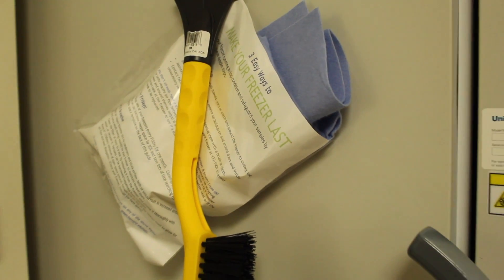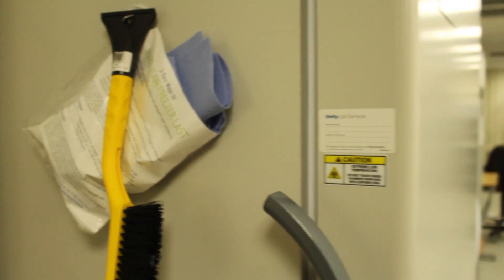In addition, we also manage our freezer library through an Excel spreadsheet, so we know exactly where each of our plates is in the system, and then have routine maintenance on our freezers to make sure that they're operating at peak efficiency.